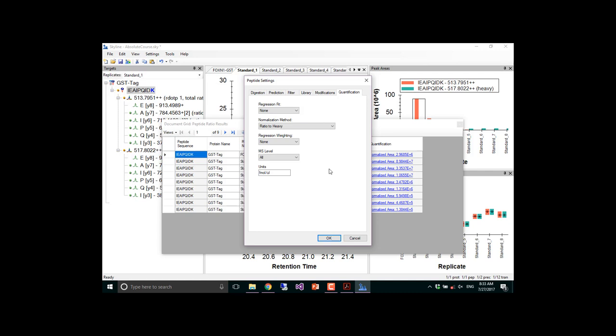But we want to get a baseline for what happens if we do this easy peasy simple method of just injecting some standard at a known concentration and estimating based on that, which lots of people do. Mike was like, let's just get that working. 90% of the people are just doing that.